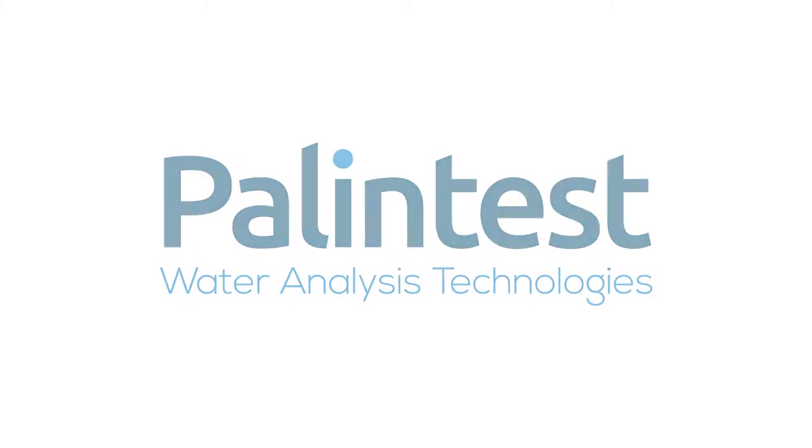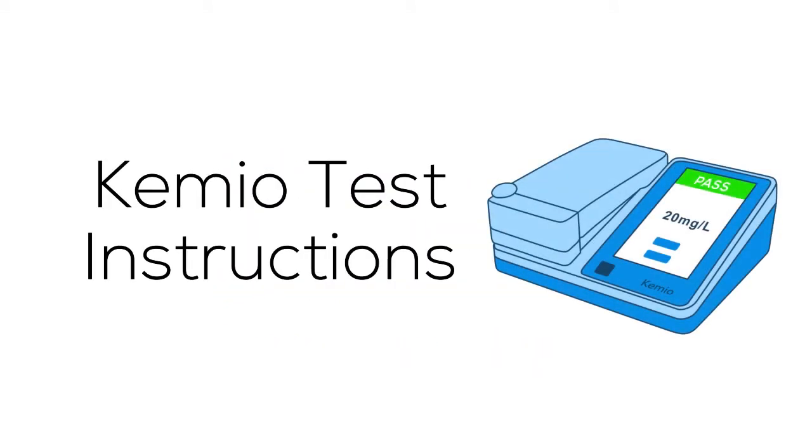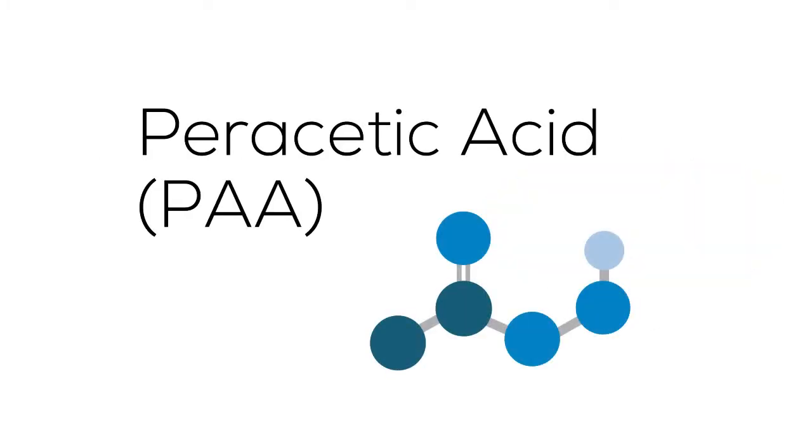Hello and welcome to this tutorial on how to use Kemio disinfection. Today I'm going to show you how easy it is to perform a test for peracetic acid or PAA.